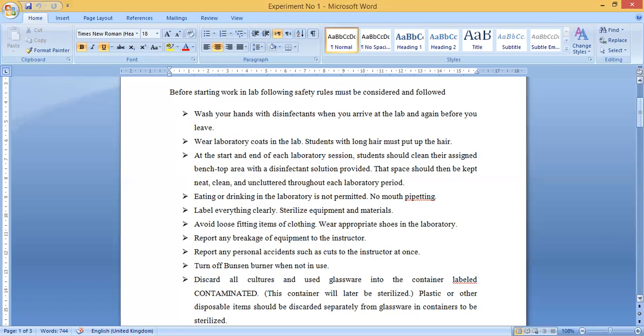The next point is to label everything very clearly, and sterilize all equipment and materials. Labeling helps avoid confusion — for example, if you put citric acid and hydrochloric acid in separate beakers without labeling them, there is a chance of mixing both acids. You must label every chemical, material, and liquid to avoid hazards. Before using any equipment such as pipettes or petri dishes, all materials must be sterilized using an oven or sterilizer.